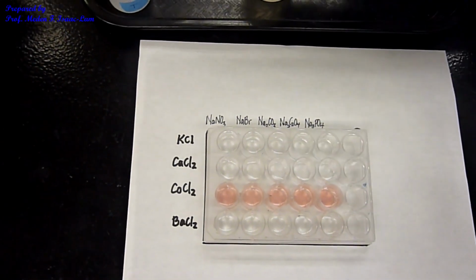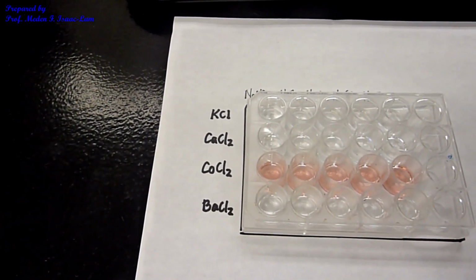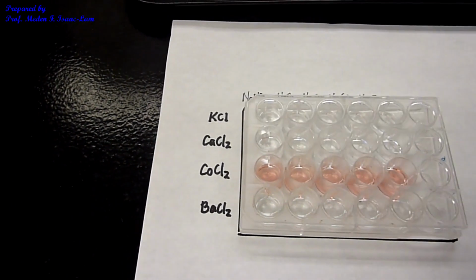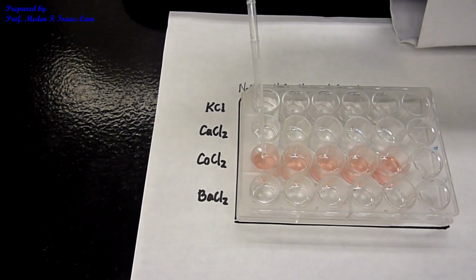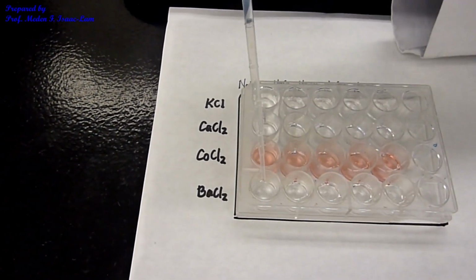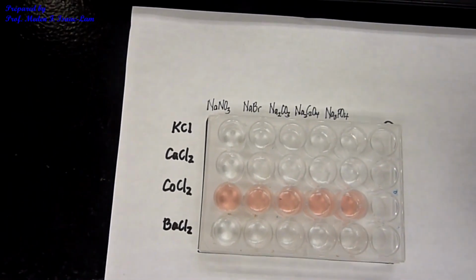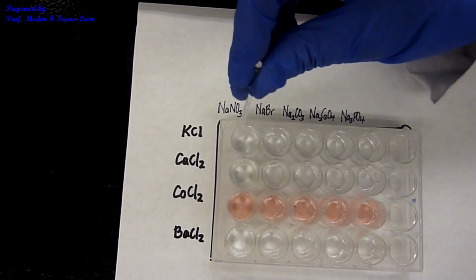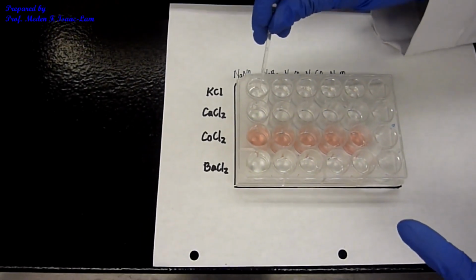And then we're going to observe. Sodium nitrate. I just want to be careful that it doesn't mix up with the other. Then I'm going to stir it with a stir stick. I don't see any change. It's just a clear solution.